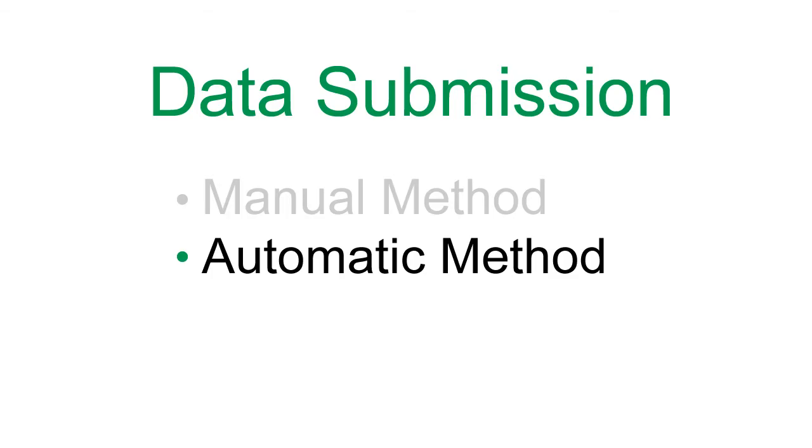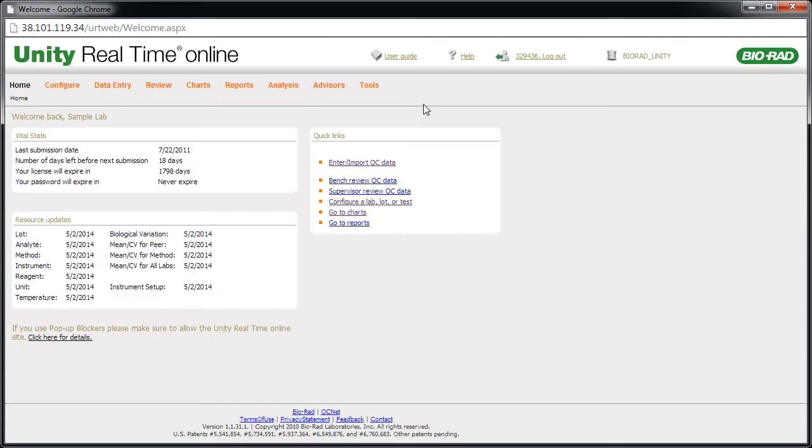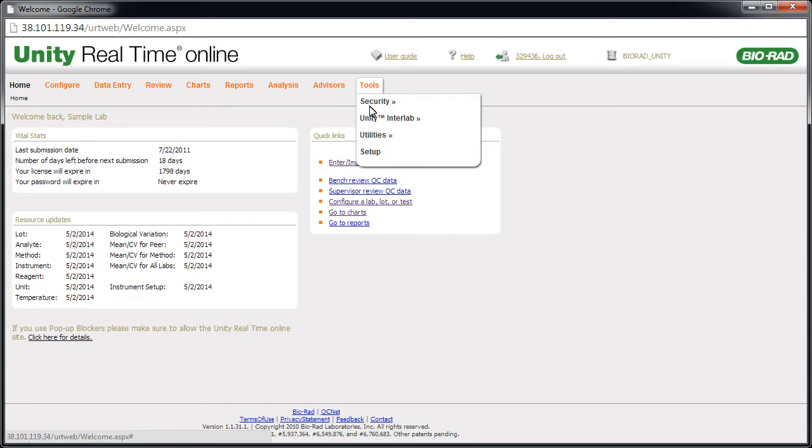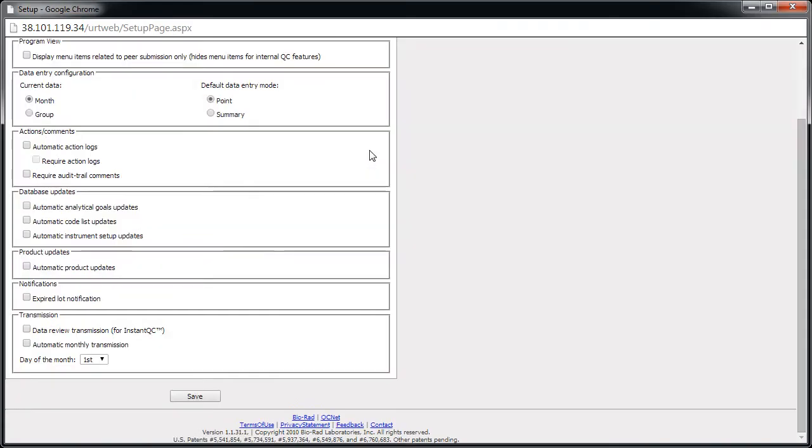Unity Real-Time Online can automatically submit your data. To set this up, point to Tools and click Setup. Select Automatic Monthly Transmission and choose the date you want the software to submit the data.